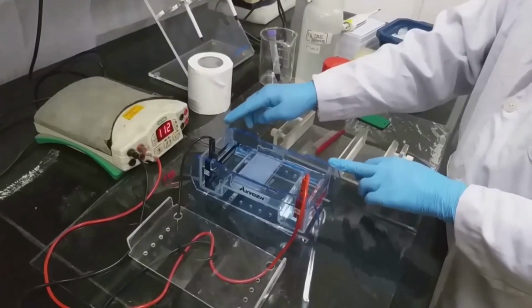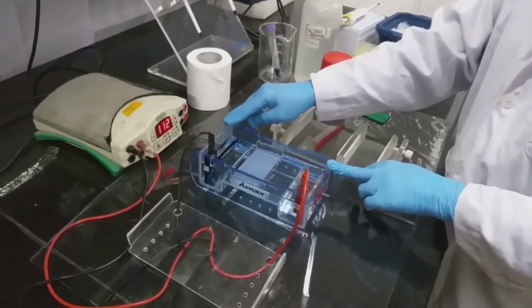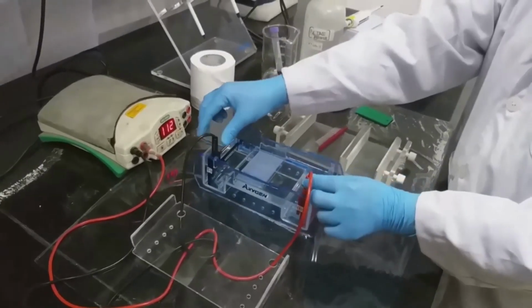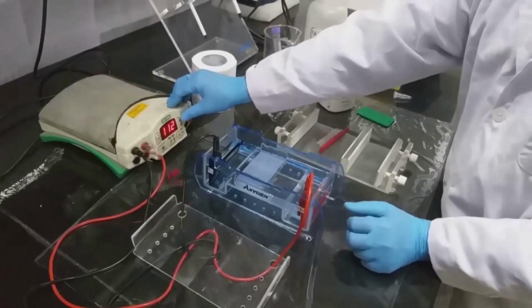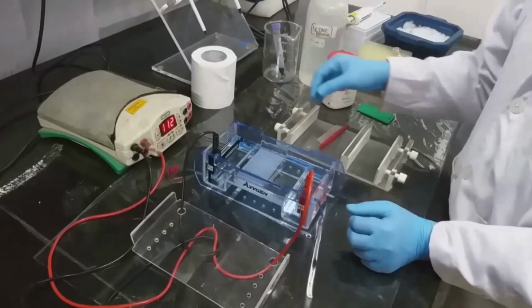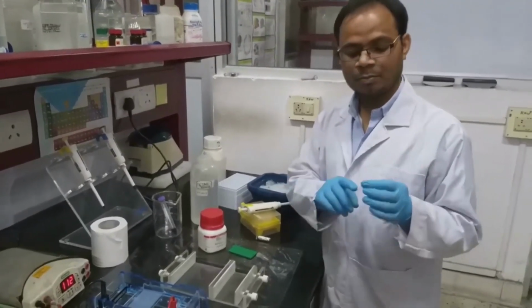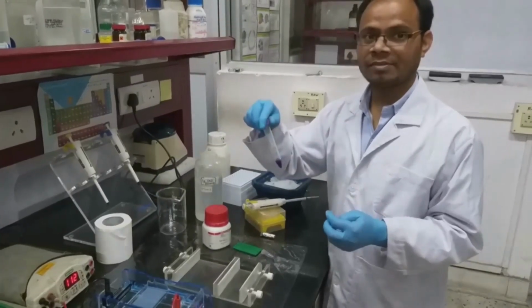Generally, for analyzing DNA samples, we use agarose gel electrophoresis. This is the power pack and this is the electrophoretic apparatus. This is the negative electrode and this is the positive electrode. We can change the voltage from here. For loading the sample, we have to mix the PCR reaction mixture with 5x loading dye.